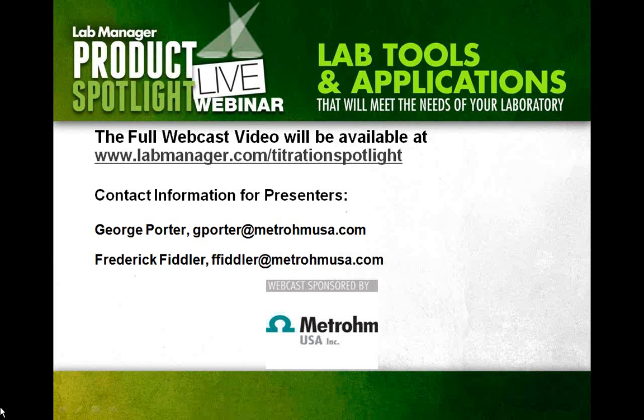Okay. Our titration equipment does not attach to other companies' instruments, but our Tiamo software is actually able to incorporate other companies' instruments with RS-232. We can use our software to control and collect data from those. So, we readily incorporate other companies' instruments into ours, but not as much the other direction.